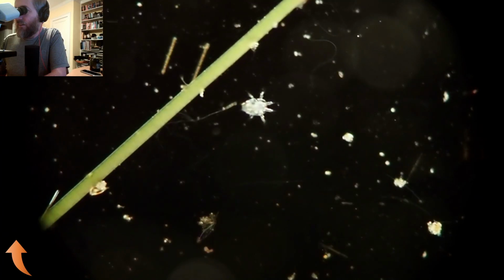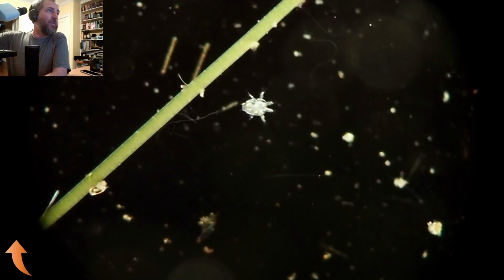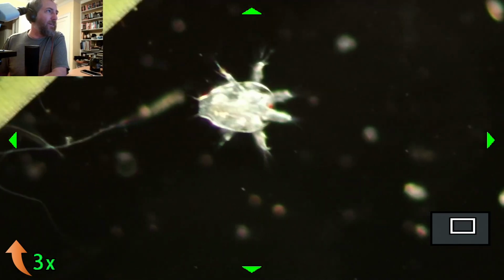Yeah, he's extra twitchy. Doesn't want to sit in any kind of a focal plane. Oh, there's a Vorticella, or maybe it's a dead one. Maybe it's still alive. I guess if I wait long enough, it might move.